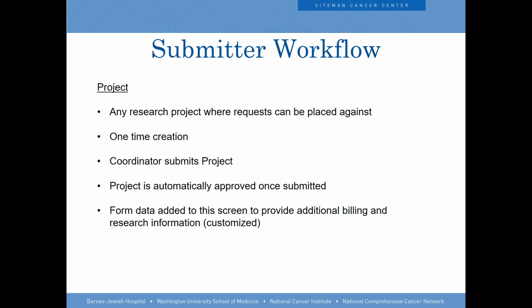This was a big thing, and one of the first requirements, because folks that were placing these requests in the old system had no idea what was happening to them. When's my request going to be done? When's it scheduled to be done? Has it even been started? Things like that.